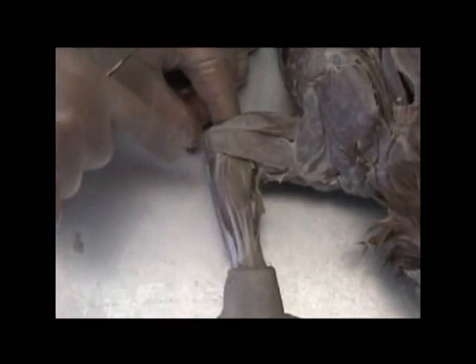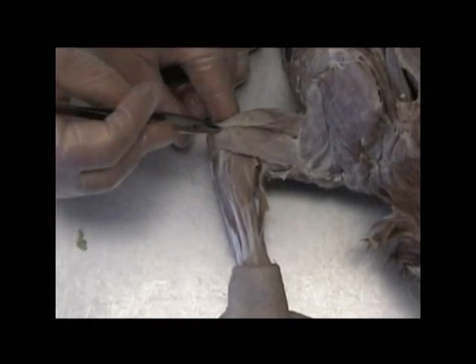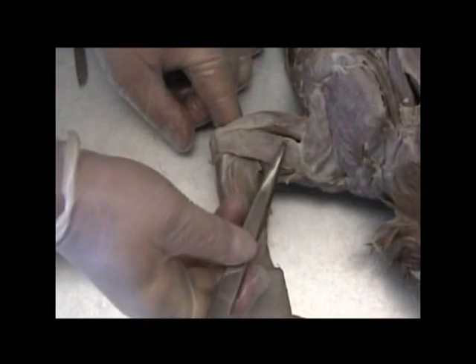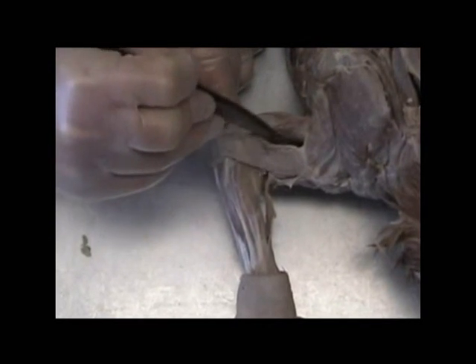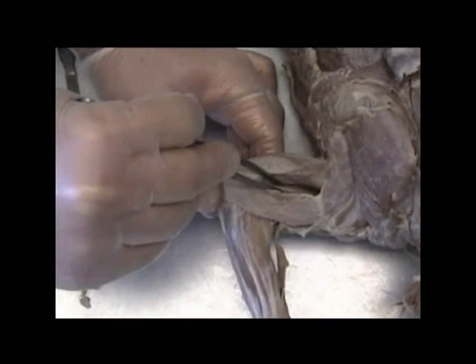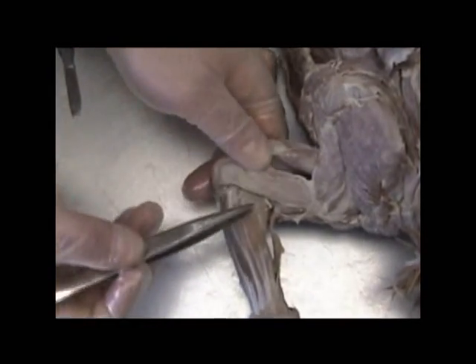Working on the lateral or the side view of the forelimb or the foreleg. And this is the muscle we just saw before that was running, we could see from the medial portion as well. We said this is part of the triceps. This is the long head of the triceps. Then more lateral to that is the lateral head of the triceps. And if we move those two bellies apart, what we find is a muscle in between, much reduced in size, the belly of that, which is the medial head of the triceps. So the long head, the medial head, the lateral head of the triceps.